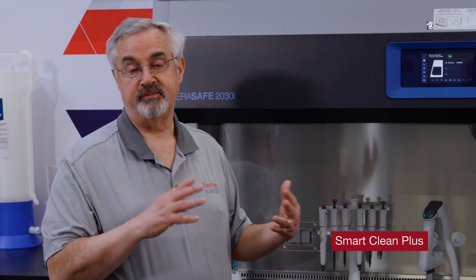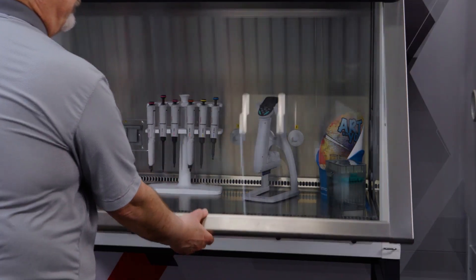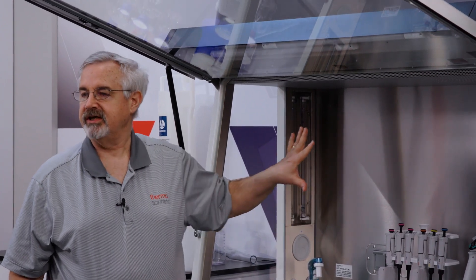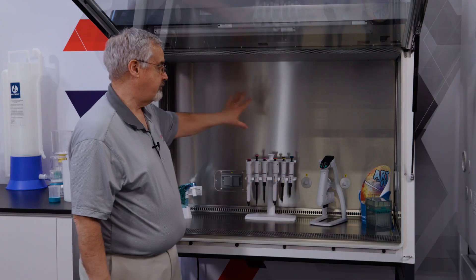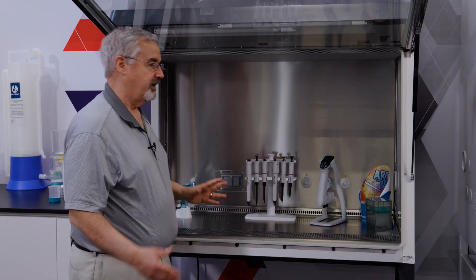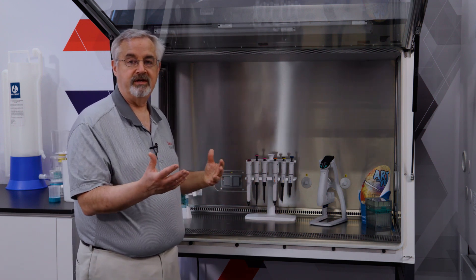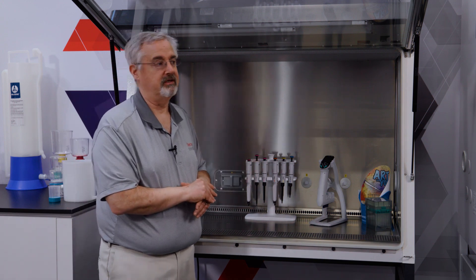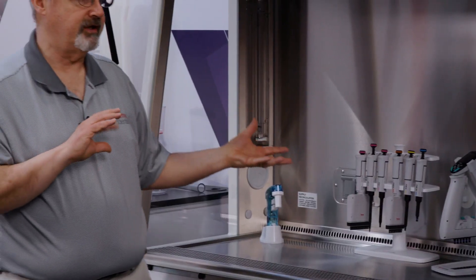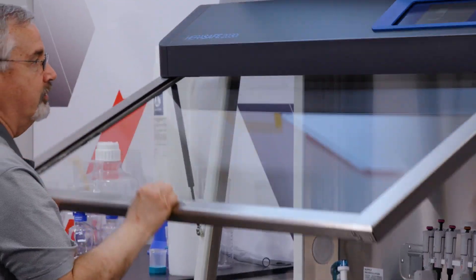With the motorized window in the closed position, we can see Smart Clean Plus. With the window closed, we can raise the frame out, and this gives us 100% access into the cabinet working sample chamber. We can easily wipe the sides, back, and work surface. If we have large equipment that we're removing or replacing within the cabinet, or need to make adjustments, we can do that very easily and then close the window and use the cabinet again. This is a relatively unique feature that gives you very nice access into the cabinet work area.